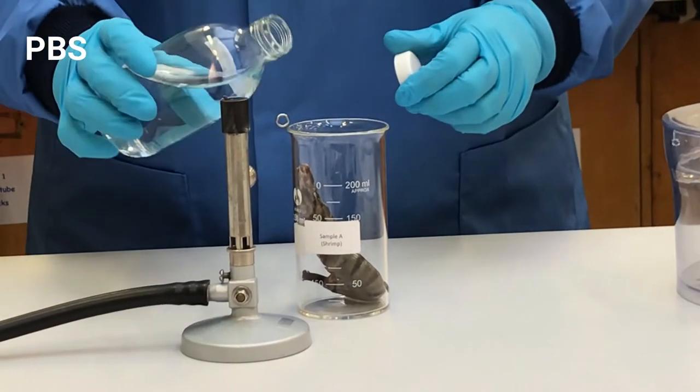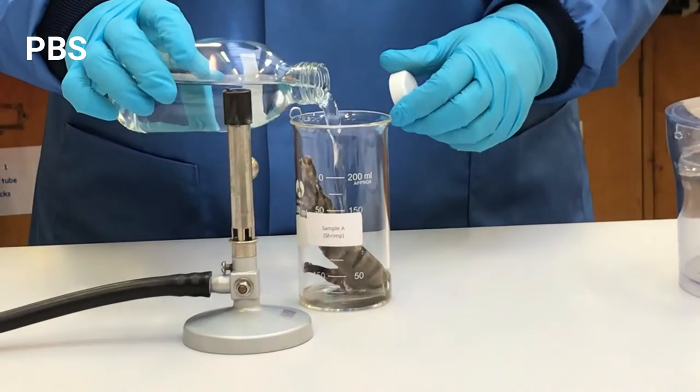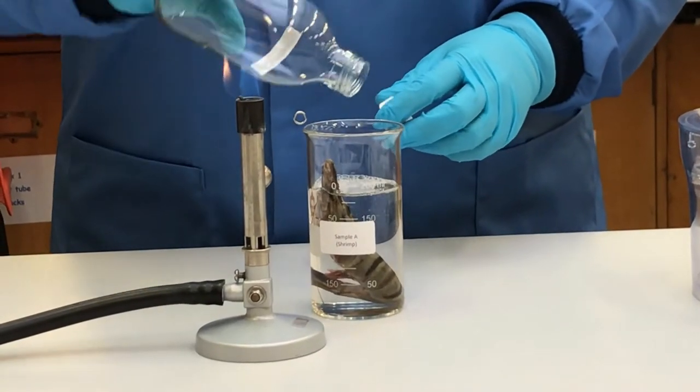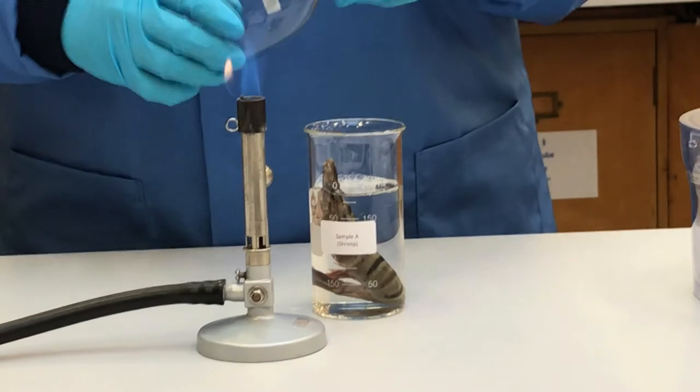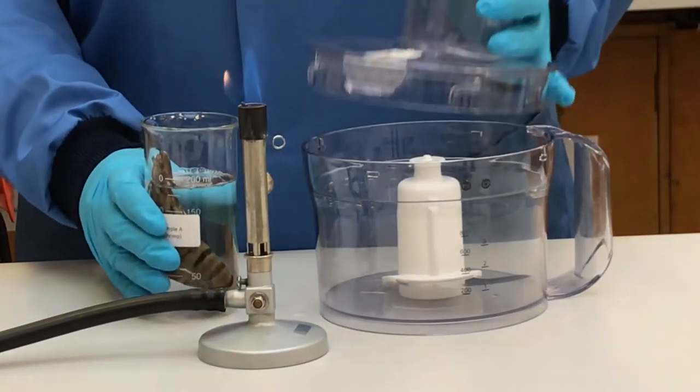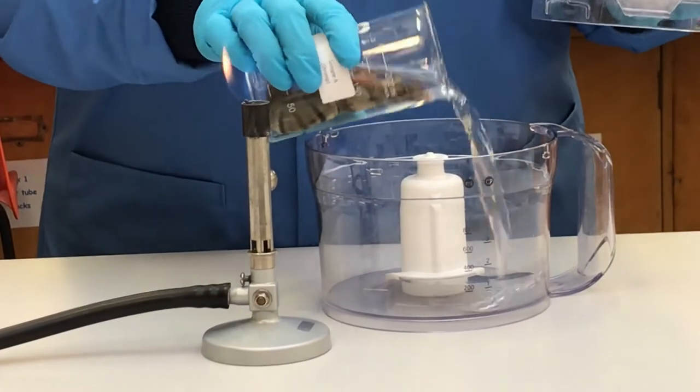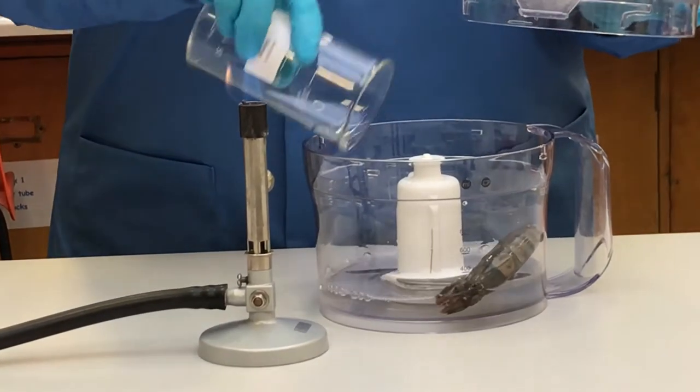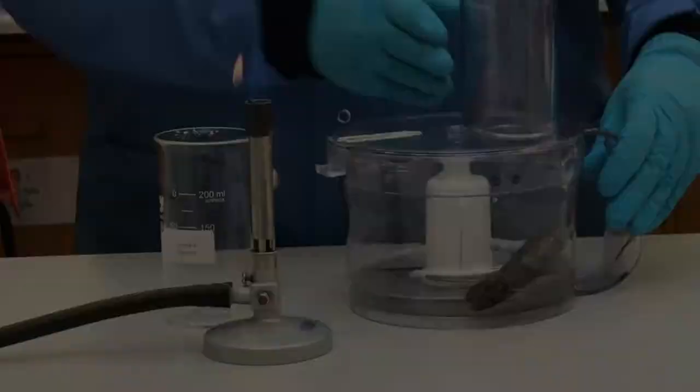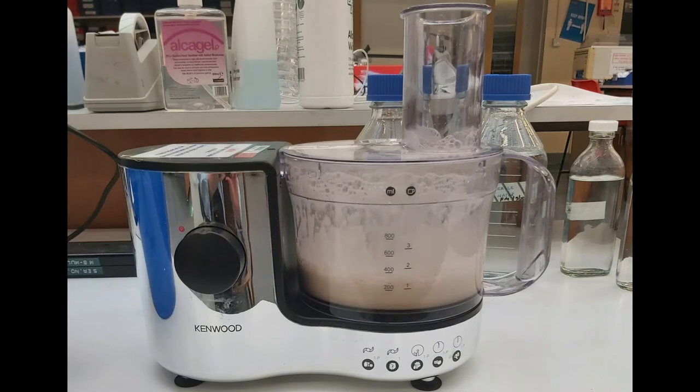Firstly, 180 ml of phosphate buffered saline is added to Sample A. This is then transferred to a blender and blended for 5 minutes. Please note that Sample B has been prepared in exactly the same way. This blended mixture represents the 10 to the minus 1 dilution, as 20 grams of shrimp has been blended in 180 ml of saline.